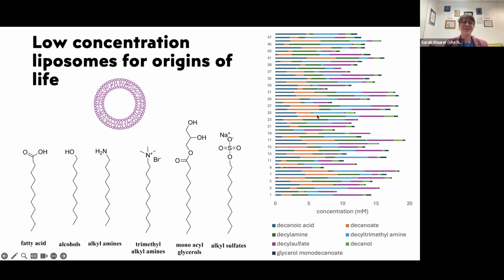Yeah, so that is a really great question. And I would be interested in thinking about different, weirder membranes for life, and if they would be more stable. Stable is a hard thing to define in a lot of ways because it could mean many different things. But for example, there's a lot of issues with mRNA vaccines and low temperature stability. And I think that there's an opportunity there to come up with formulations using this method that could improve pharmaceutical applications.